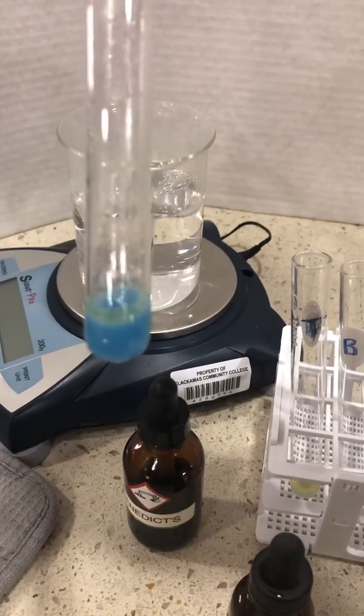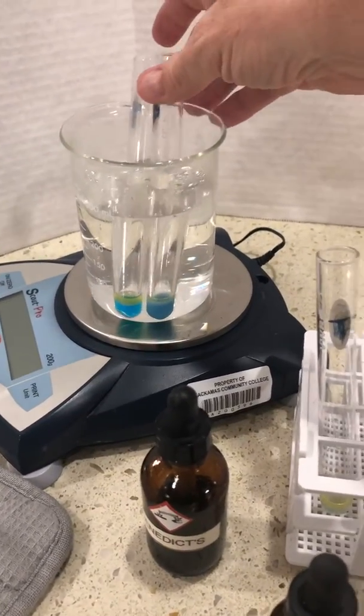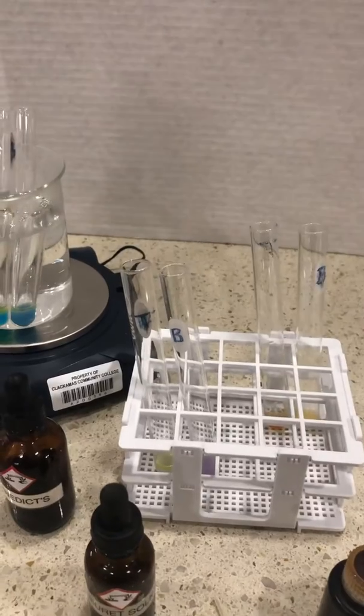Note all of these colors, record them in table 2.2, and complete your interpretation of results.